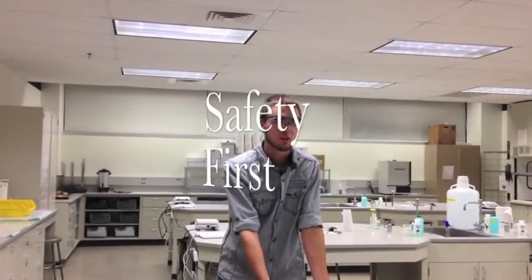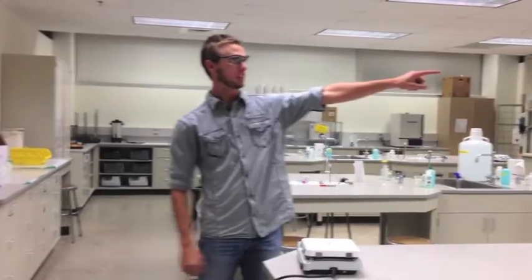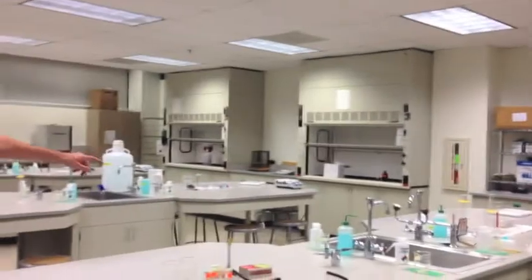Before we start, we need to go over some safety. First off, you need to make sure you have safety glasses on at all times. Also, make sure you don't have any loose clothing and make sure your hair is back. You need to know where your emergency gas shutoff valve is. Ours happens to be over there. Also, emergency eye wash, I know it's there, and shower, which is right outside.